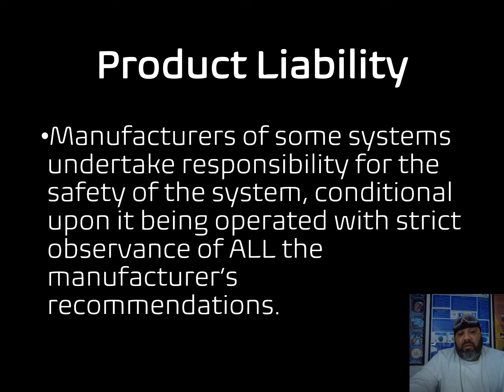And so, following this, I talked a little bit about product liability, but generally speaking, manufacturers of some systems undertake responsibility for the safety of the system, the safety of the pathology automation, on the condition upon it being operated with strict observance of all the manufacturer's recommendations. So product liability in pathology practices is a focal aspect in relation to particular standard operating procedures, which all health professionals in laboratory practices generally have to be aware of as well.